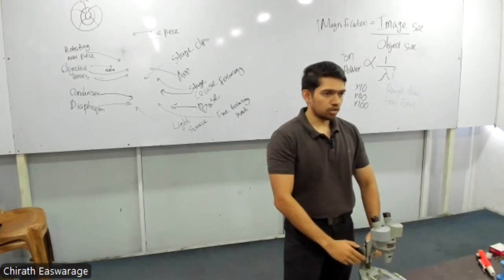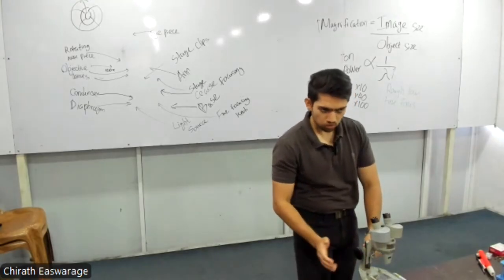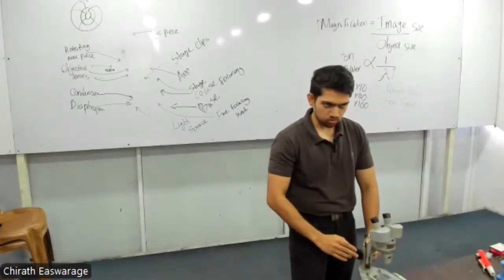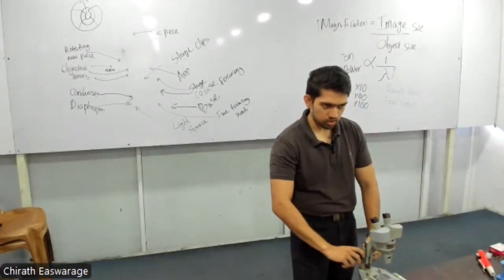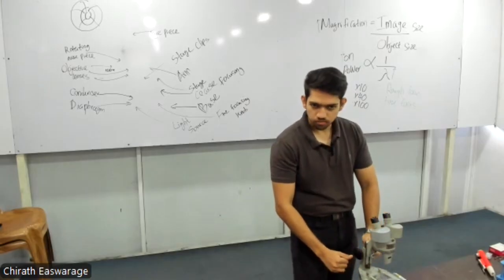In fine focusing, actually, to use the fine focusing, we have to lock the coarse focus, right? There's a sort of locking mechanism in the coarse focus. You have to lock it, otherwise you can't rotate the fine focus.